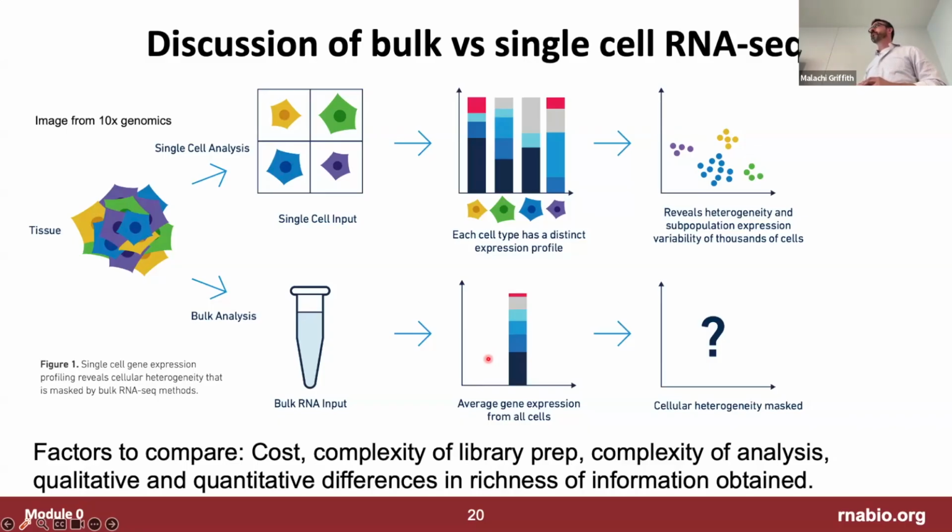Sometimes also, in a different sense, you have cells that are tightly associated with each other. You might still bust them up. Yeah, so Obi just added the point that there are sometimes cell-cell interaction reasons, in that there are cells that are difficult to dissociate from each other without damaging the cells anyway, whereas the nuclei might be more robust. If you do the homogenization to the level of nuclei, you're getting back to the single nucleus that was in each single cell.